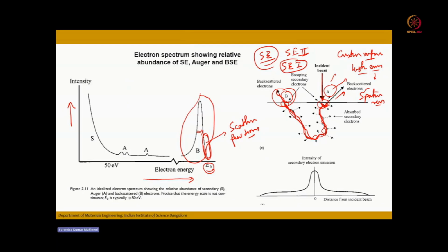Okay, so secondary electrons are generated by both the primary electrons and also the escaping backscattered electrons. However, the number generated by the primary electrons will be numerous, very high. These secondary electrons usually originate from a very small area which is near the beam size.